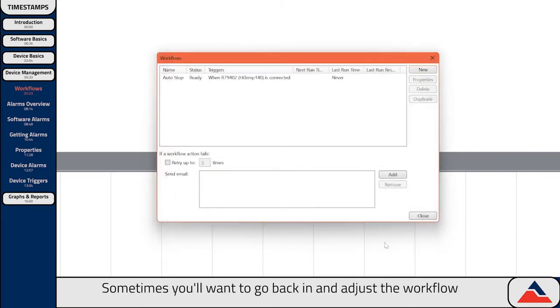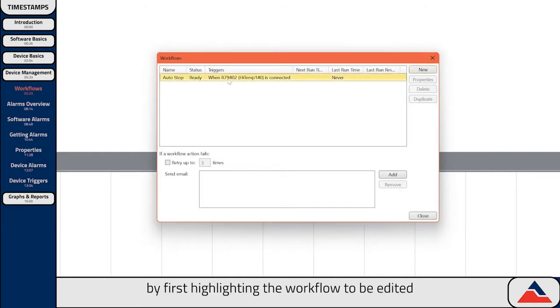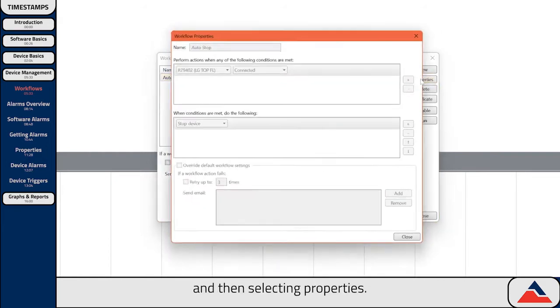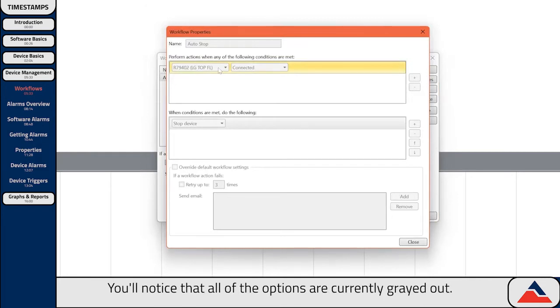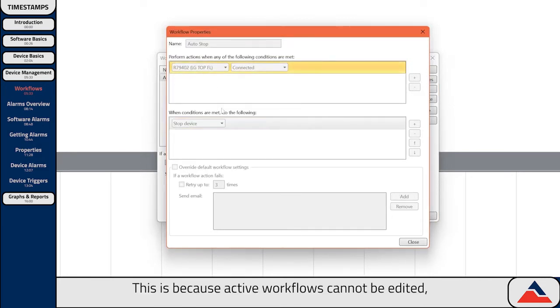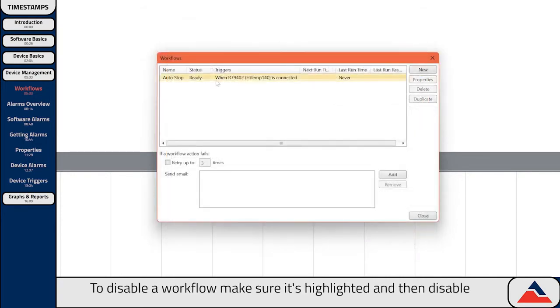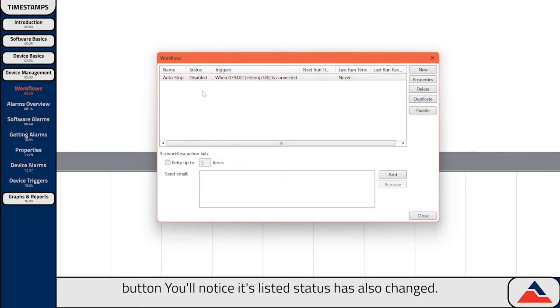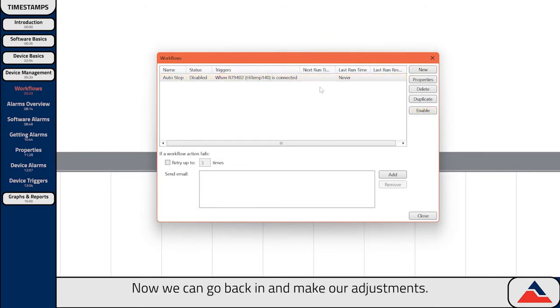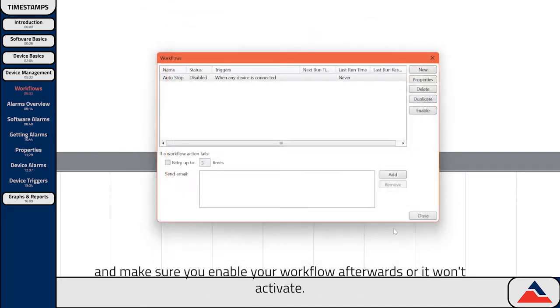Sometimes you'll want to go back in and adjust a workflow you've already created. You can do this by first highlighting the workflow to be edited, and then selecting Properties. You'll notice that all of the options are currently grayed out. This is because active workflows cannot be edited, so we'll have to disable it first. To disable a workflow, make sure it's highlighted, and then hit the Disable button. You'll notice its listed status is also changed. Now we can go back in and make our adjustments. When you're all finished, hit OK, and make sure you enable your workflow afterwards, or it won't activate.